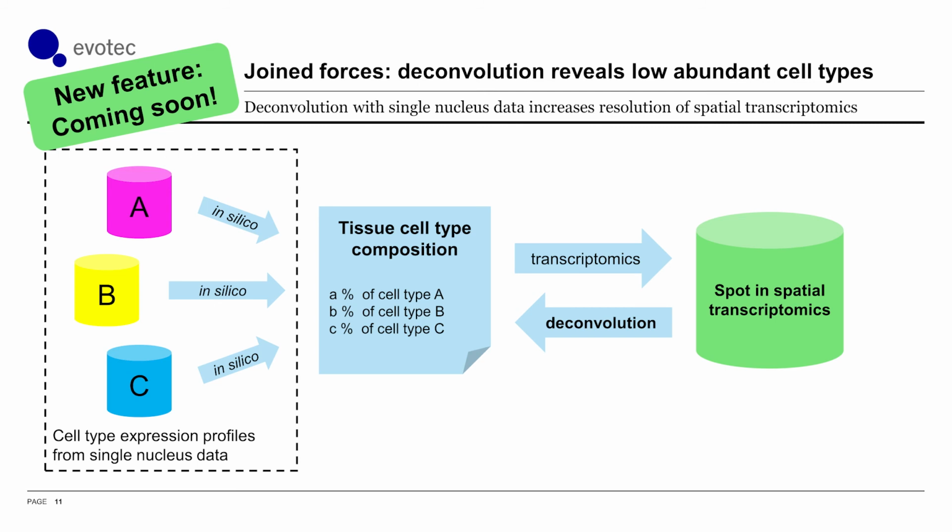You could think of it a little bit like trying to remix or reproduce the current color of your wall just from base colors without knowing the exact mixing ratio. By measuring how much of which component color you're using until you've matched the original color, you would be able to reconstruct the recipe for the entire composition.